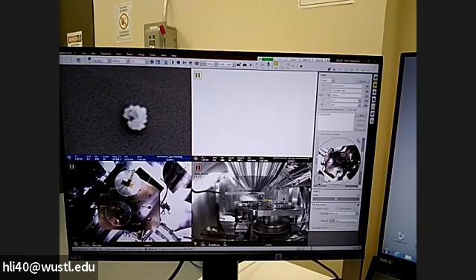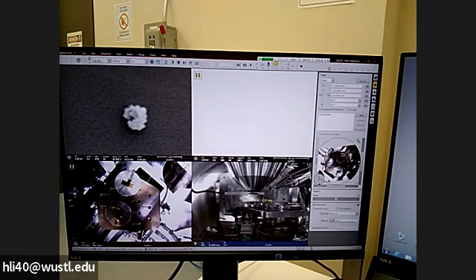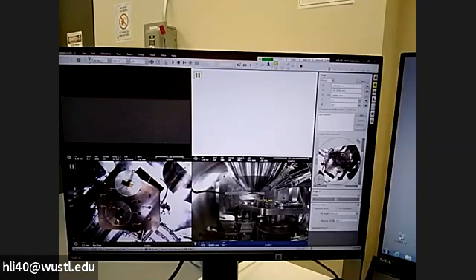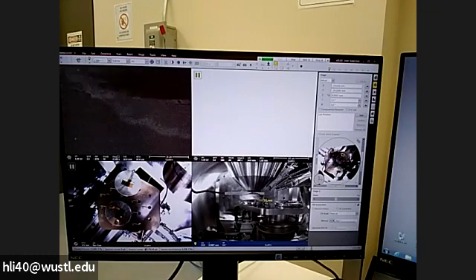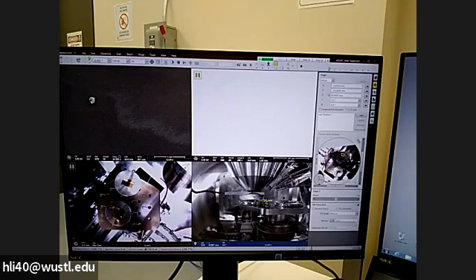After I type 10, if you pay attention to here, if we can keep this on, this is my sample location. If you click 10 and click enter, you will see the sample will move up, and your location should still be maintained, similar. The magnification is actually 10. So your target should still be around that place. I need to do some alignment on this microscope.